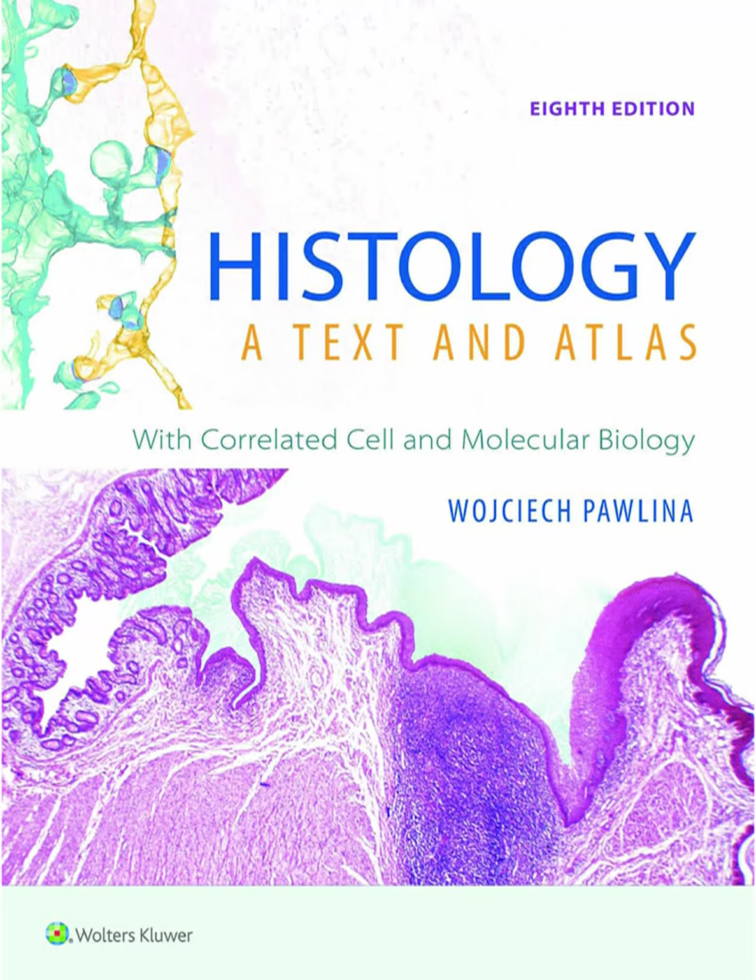Cool. What else? There's dark field microscopy. In this setup, the condenser blocks the direct light path. Only light that is scattered by tiny structures in the specimen actually enters the objective lens. So small particles appear as bright specks against a completely dark background. Like dust motes in a sunbeam. Exactly like that. It's very useful for visualizing things that are too small or hard to stain properly, like certain bacteria, such as spirochetes.